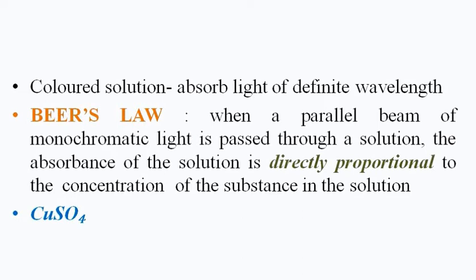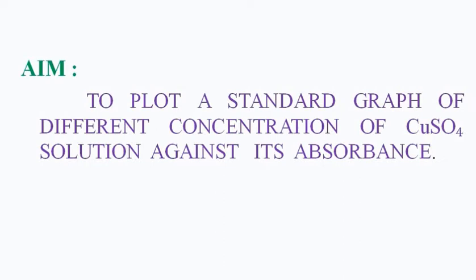So in order to verify this, we are going to use a colored solution. What colored solution? A blue colored solution. What is it that we are going to use? We are going to use copper sulfate solution. So the aim of today's experiment will be to plot a graph of different concentrations of copper sulfate solution against its absorbance. This is the aim.